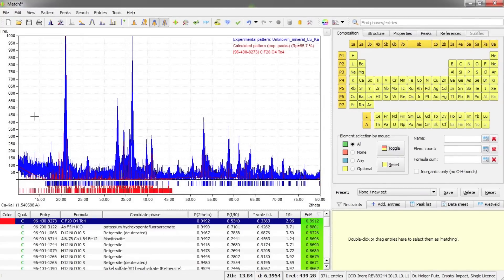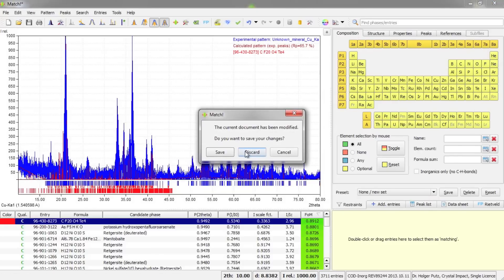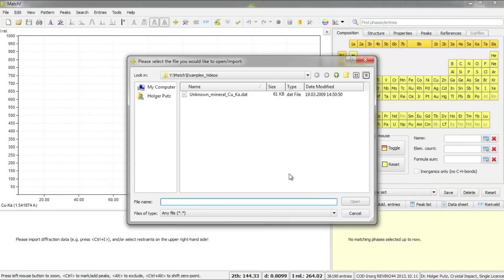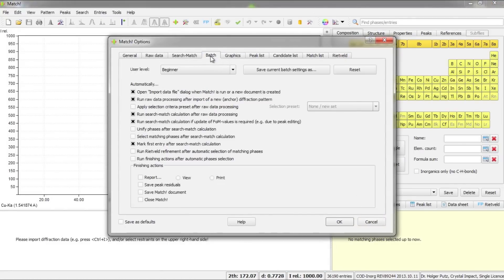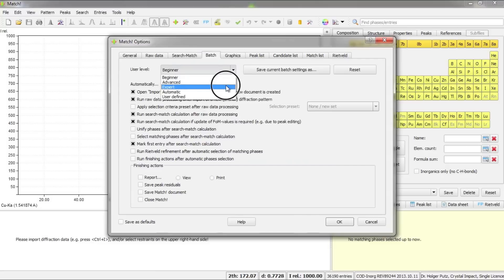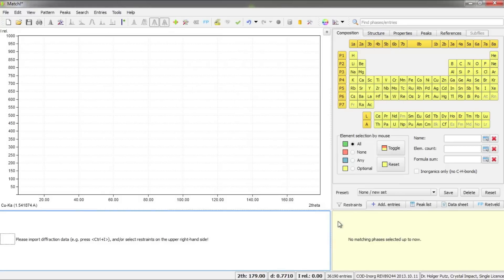Now let's return to our intention to edit the raw data manually. I will open a new MATCH document and skip the automatic import step. I'll tell MATCH not to do everything automatically. The easiest way is to adjust the user level in the Options dialog — I'll switch it to Expert and press OK. Now the program won't do any automatic processing but will leave it to me.